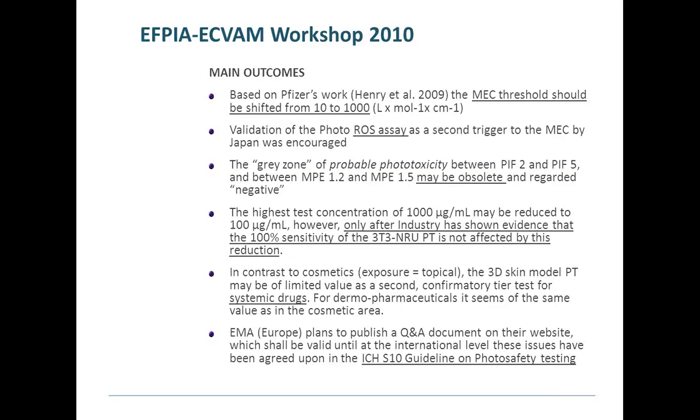Phototoxic. And then when you have an increase in your sensitivity above 5, you take it as definitely phototoxic. So this "probably phototoxic" category was, let's say, an agreement zone, but it was not that important, and people desensitized to it, so now take it away.